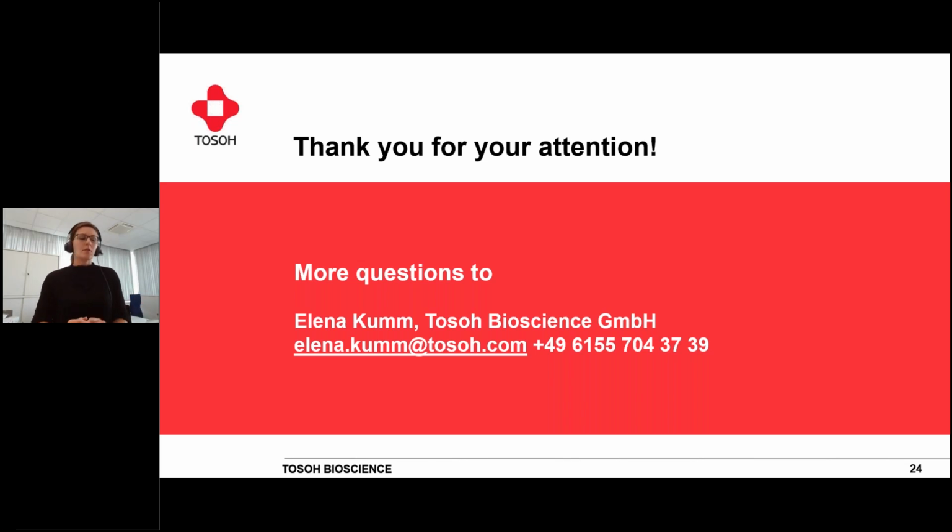And you could then afterwards still see, if I change my pH a bit, in what direction, what happens. But only change one setting, just change the pH and not also the flow rate in parallel, for example. What you also could do is start with the lowest amount of salt that is possible, and then you can still increase it if your separation doesn't look good.